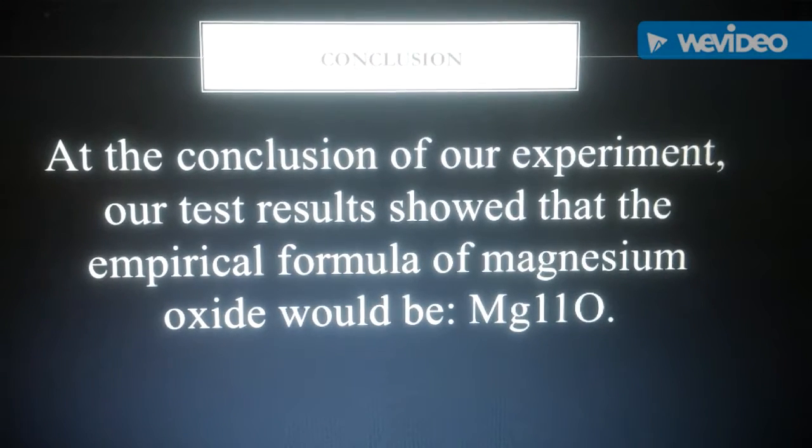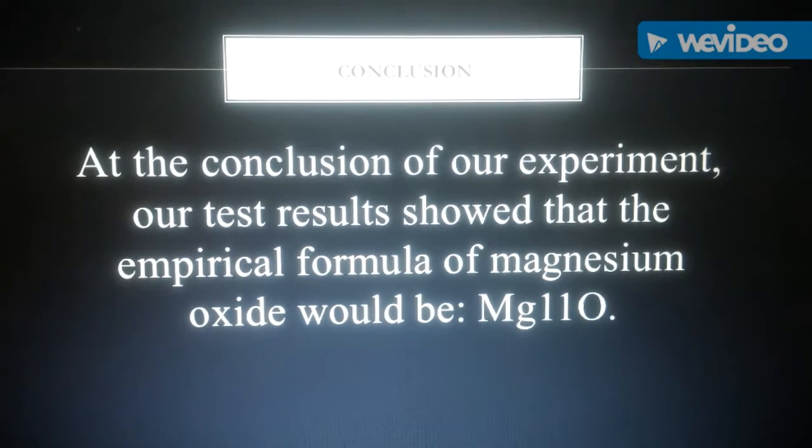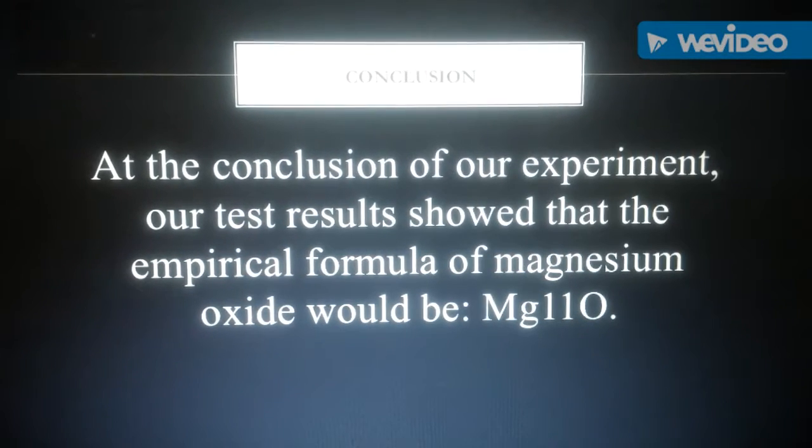At the conclusion of our experiment, our test results showed that the empirical formula of magnesium oxide would be magnesium 1 oxygen 1.